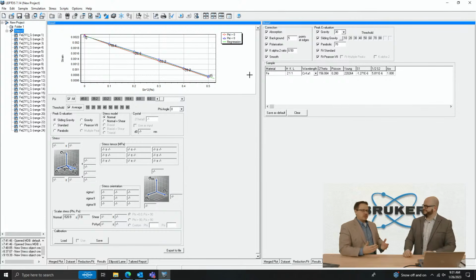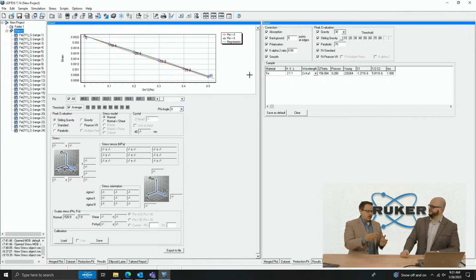So they had to solve this, and we measured it and found out it was a tensile stress from the deposition process, the temperature of the sink during deposition. That meant that as the water cycled hot, cold, hot, cold, microcracks formed and would just open up. The whole coating rips off, flakes, bad coating.